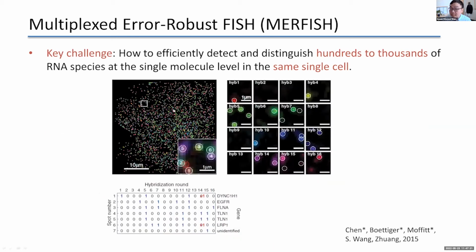In a real image, it looks like this. So this is one cell, and different dots are individual RNA molecules. The different colors you're seeing here are pseudo colors showing the different RNA species after the decoding. In fact, the whole experiment here is performed with a single color channel for RNA FISH. So in this area, there are multiple molecules. Let's focus on molecule number 2 here.